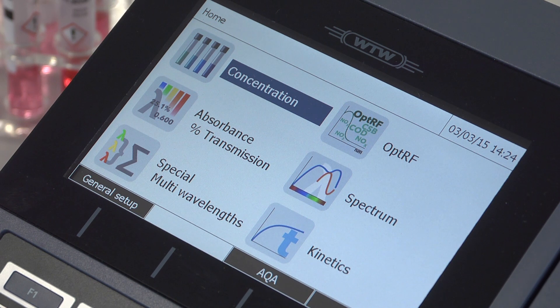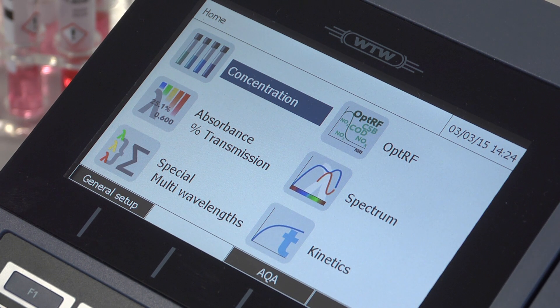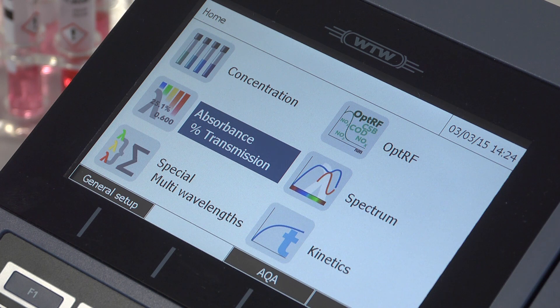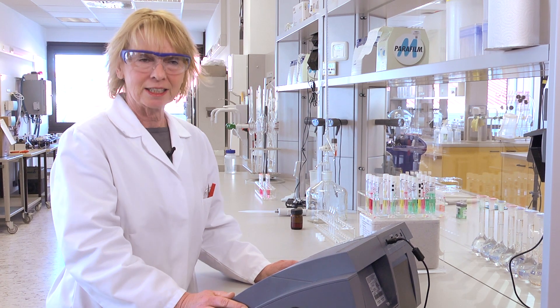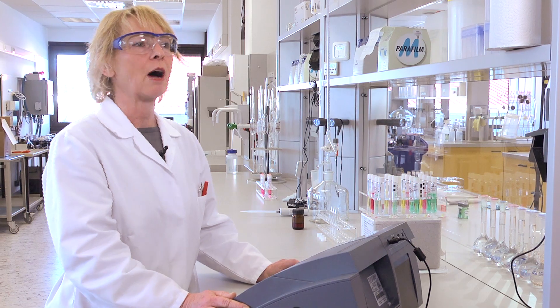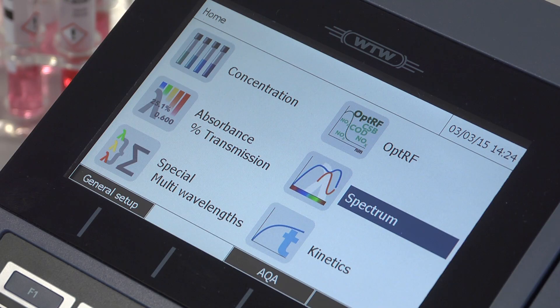Looking at the home screen, we can see possibilities to take readings for the concentration, absorbance, and transmission, plus special and multi-wavelength functions. We can also take spectrum readings and run kinetics.